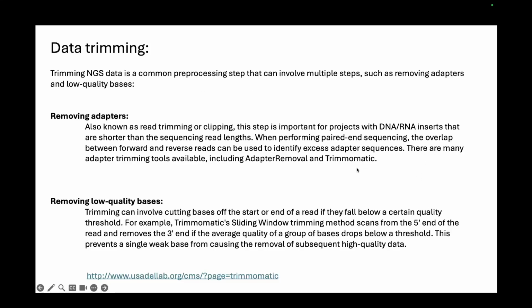The most widely used is Trimmomatic. It can identify these adapters and remove them. There is one module in GATK as well, MarkIlluminaAdapters, where it can mark those adapters, and then after that you can use SAMtools or any other software just to remove those. So there are multiple softwares available to do this stuff. And after removing adapters, you also remove low quality bases. So whatever your cutoff is, you keep a cutoff of that and remove all the bases that are below that quality. So your data now is good quality. You're confident about your data, and your data does not have any kind of contamination.